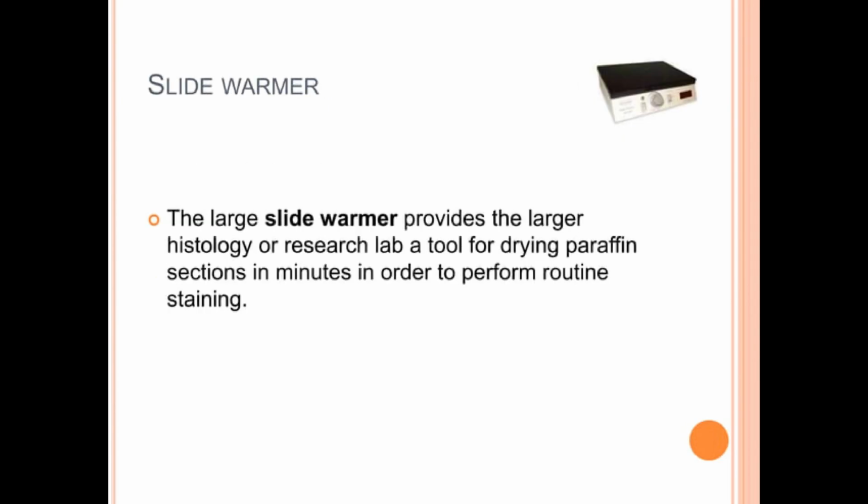What is a slide warmer? A slide warmer is used to gently heat microscope slides, ensuring that the thin tissue sections stick to the slide without wrinkling or tearing. How it works: after placing a tissue section onto a glass slide, the slide is placed on the warmer. The heat causes the wax to soften slightly, helping the tissue adhere flatly to the slide. Purpose: This step is crucial for preparing slides that can be stained and examined without distortion.